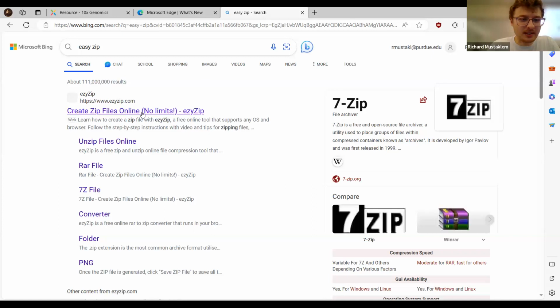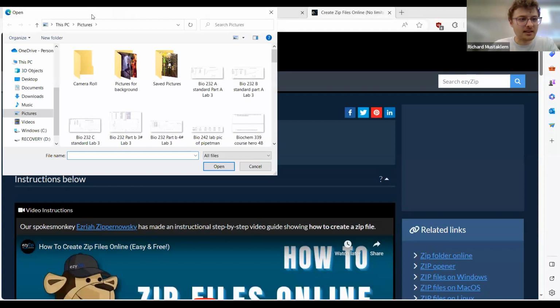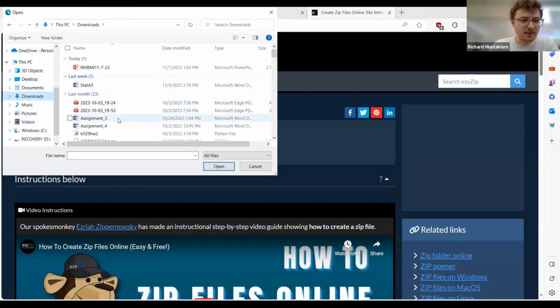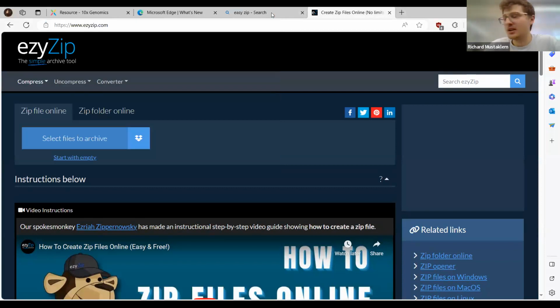Oh, I misspelled it. Okay, easy zip. Here we go. So then you select your tar file. I don't have it on me, but you select your tar file and then you download the folder that it gives you. And that's it. You're done with the data downloading.